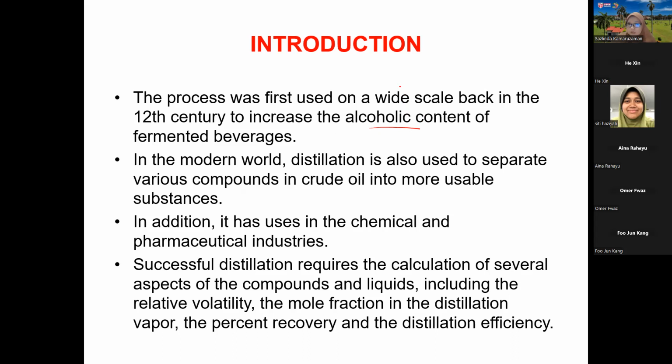For example, based on the particle size, based on the density, and when we talk about distillation, it depends on the boiling point. So when you have substances with quite a significant difference in boiling point, I think distillation is the best separation method that we can use.